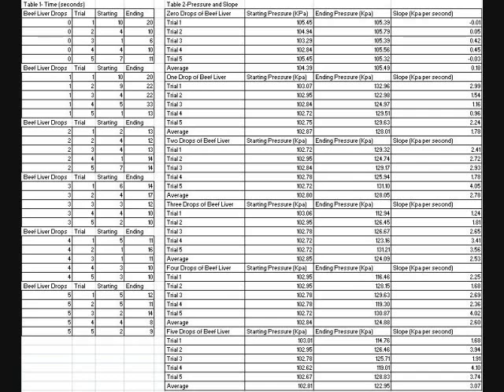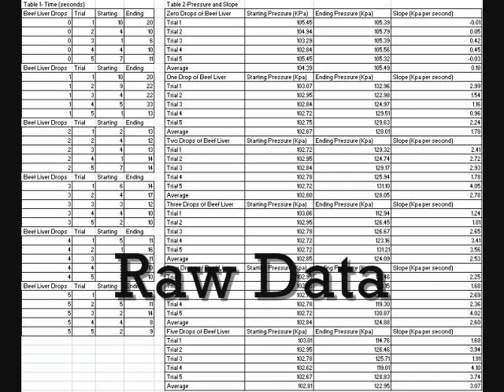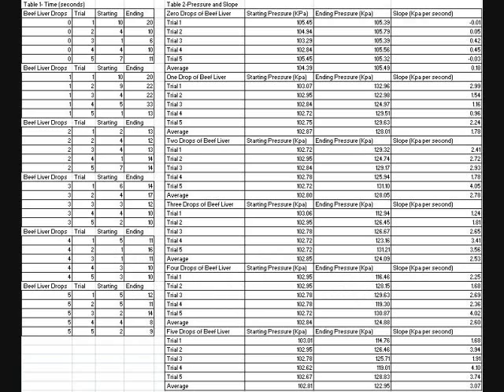Data results. The overall goal of the lab was to measure how the amount of catalase affected the rate of reaction. Basically, the reaction of the varying amounts of catalase with hydrogen peroxide was measured using a Logger Pro pressure probe. The pressure probe measured the amount of oxygen produced over time by the catalytic reaction. To calculate the reaction rate for each amount of catalase, we chose 2 points in the section of the graph that had the most consistent gas pressure.